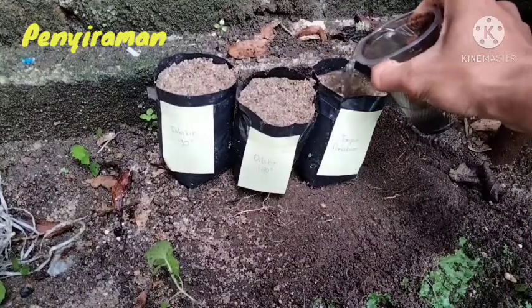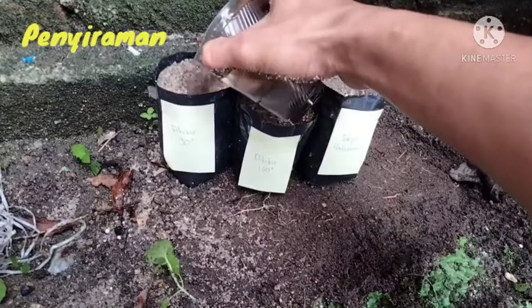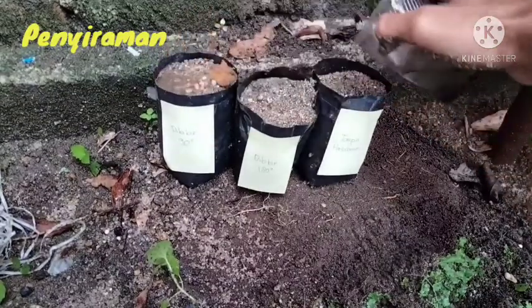Setelah dilakukan penanaman, polibag disiram dengan air. Kemudian disiram setiap beberapa hari untuk meningkatkan perkecambahan.